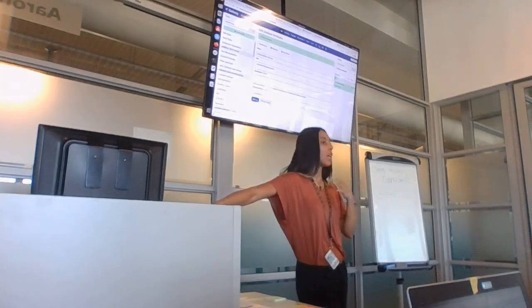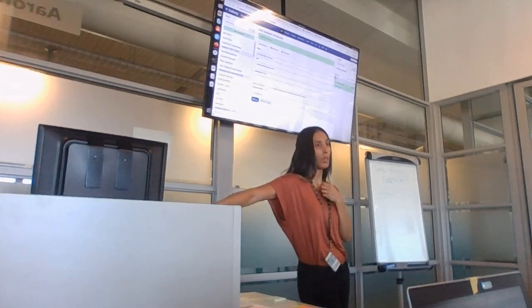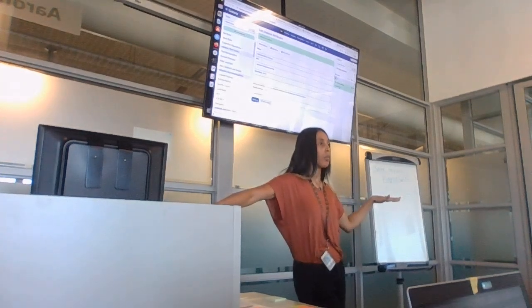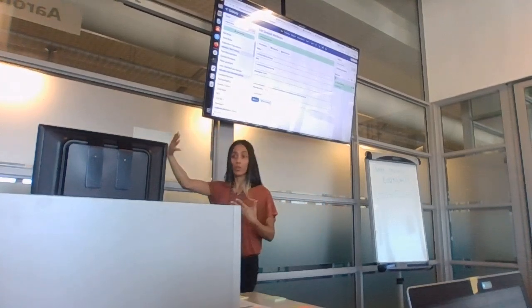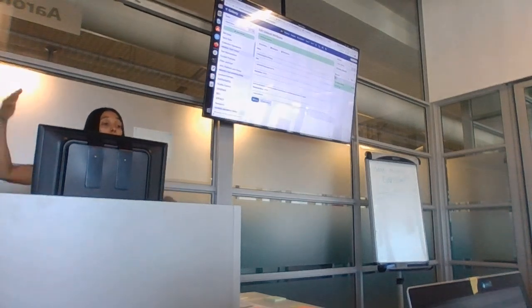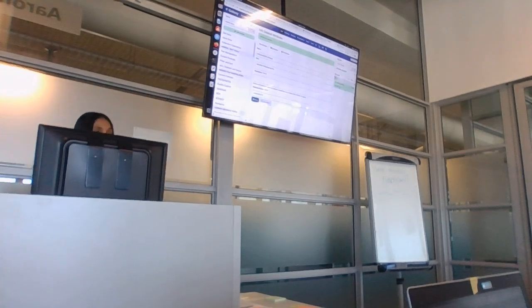Or, for example, this is something that is very complicated. You know how to do it. You don't feel like explaining it to somebody else. You just want to build them a workflow, share it with them, and say, put your dataset in here and run it, right? Either way, you do a workflow to save time and effort somewhere down the line in the future. Whether it's for you or you want to save yourself or somebody else from making errors. So you want to know exactly that person is using the right tools and you want to prevent any errors, you will build a workflow.